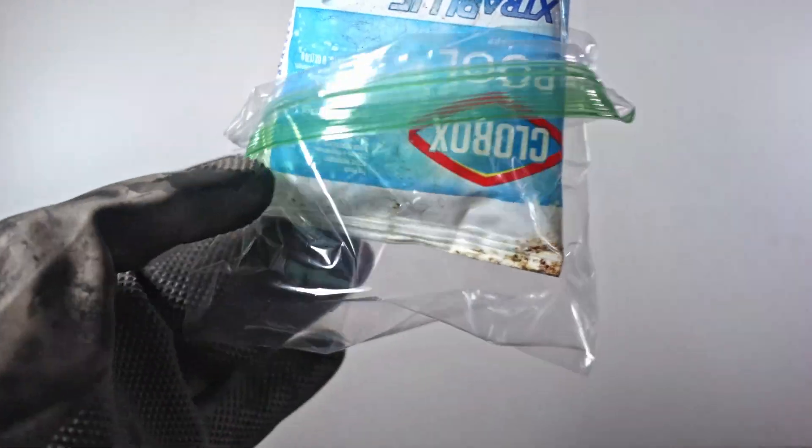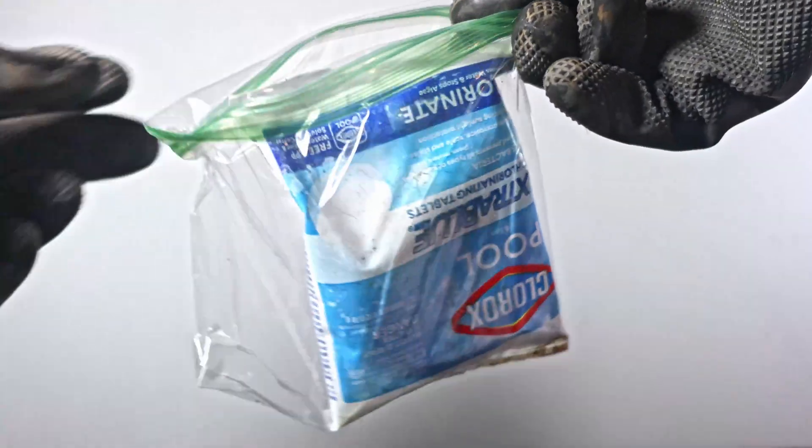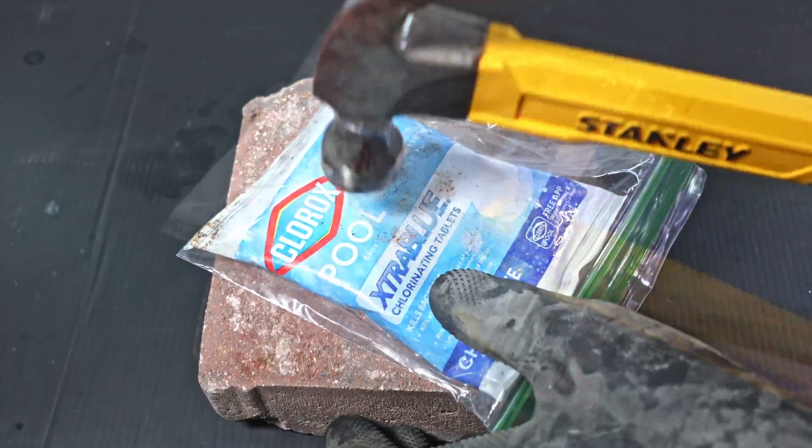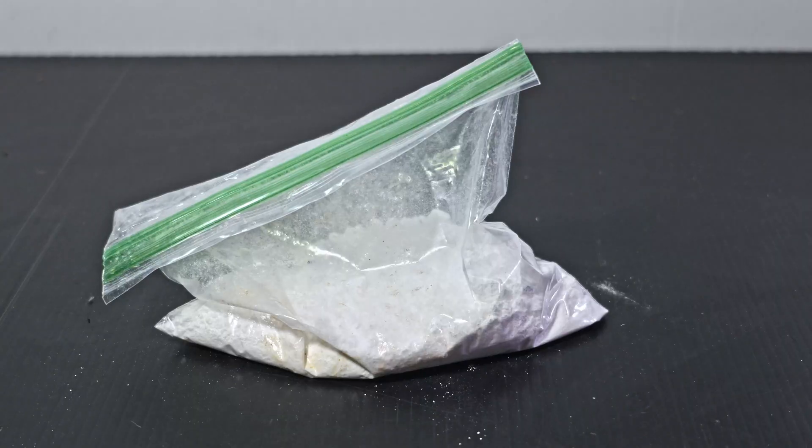The first thing I'm going to do is bag the tablets. This will give me control when I hammer it. I do low yet firm hits to pulverize the gravel while minimizing punctures. Eventually I get a nice fluffy bag of trichlor powder.